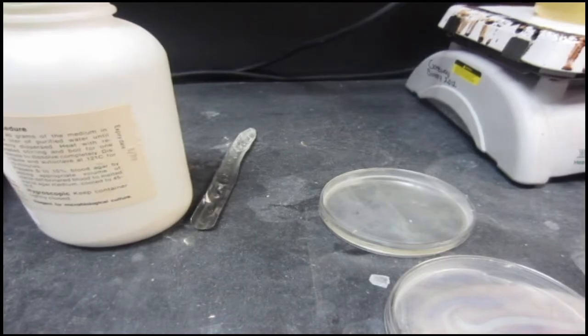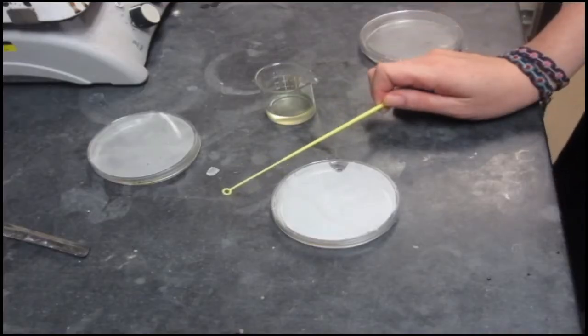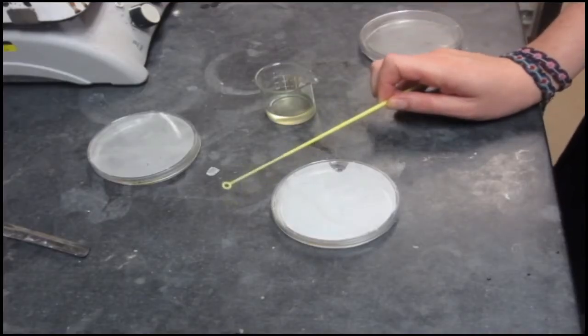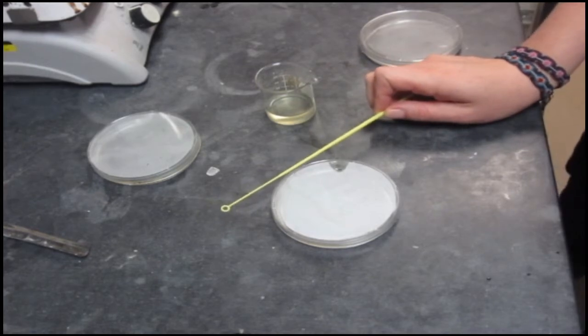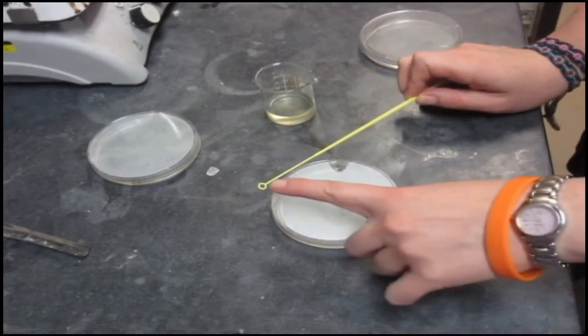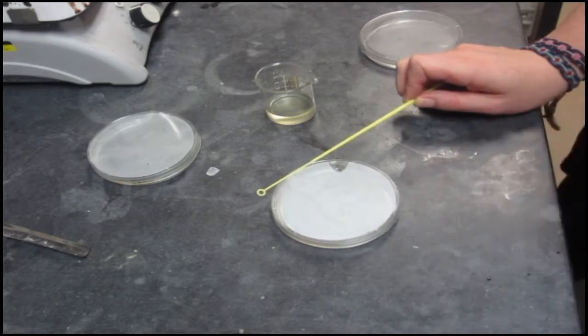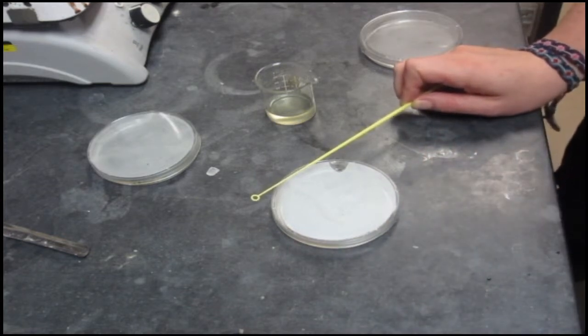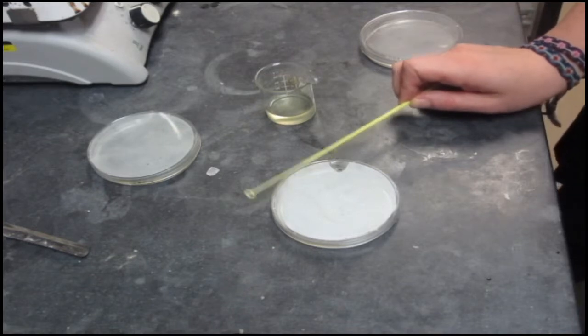When you go to plate your bacteria, you're going to use an inoculating loop like this one. When you pull this straight out of the bag, it's going to be sterile, so you know to start with that. Notice this little loop here. This loop is going to have a constant amount of bacteria that gets attached to it, so you know you'll be plating the same amount of bacteria onto each one of these plates.